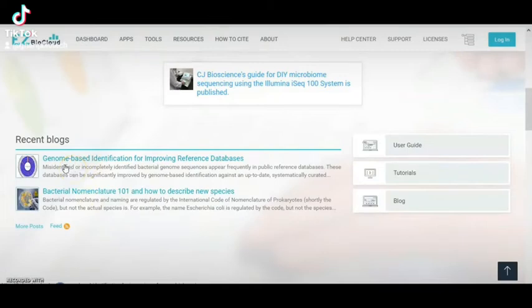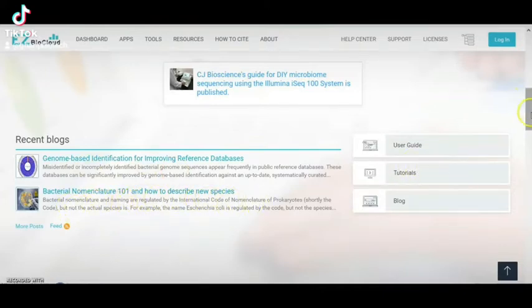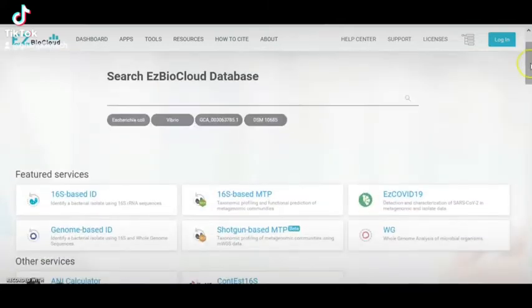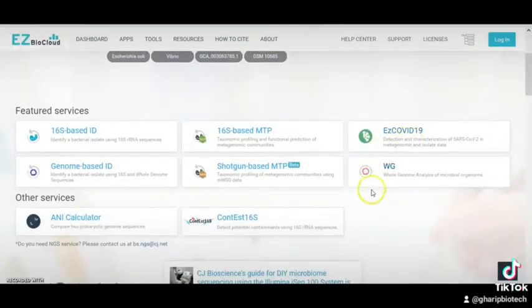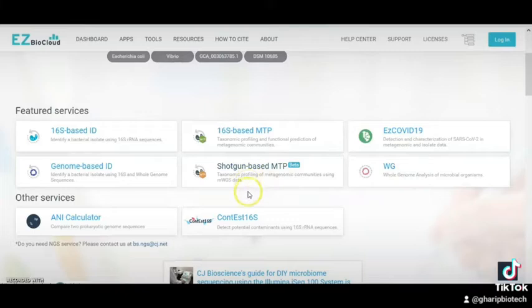We can navigate through genome-based identification for improving reference databases and bacterial nomenclature, and how to describe new species. This includes whole genome sequencing, microbial analysis, and shotgun sequencing, and their uses in the identification of bacteria.